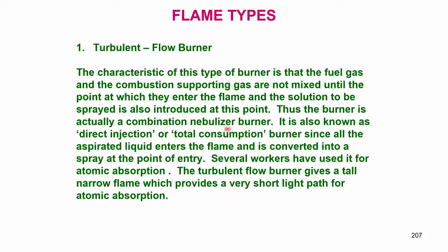This is also known as direct injection, or total consumption burner, since all the aspirated liquid enters the flame and is converted into a spray at the point of entry. The turbulent flow burner gives a tall narrow flame which provides a very short light path for atomic absorption.